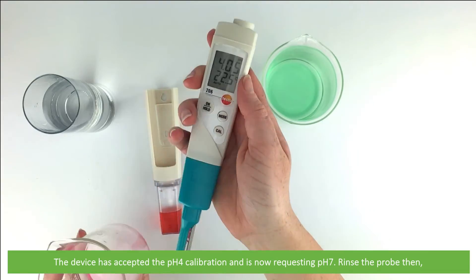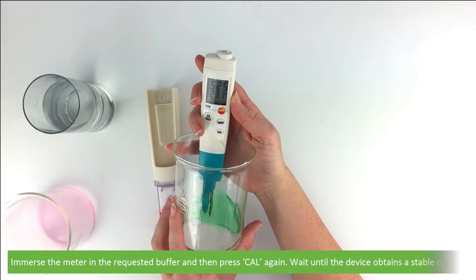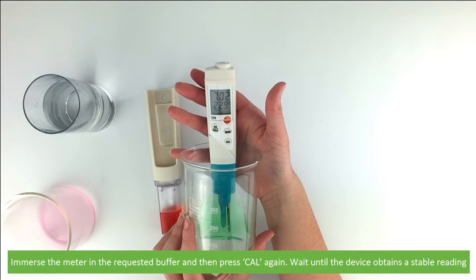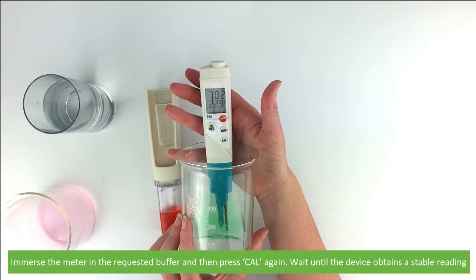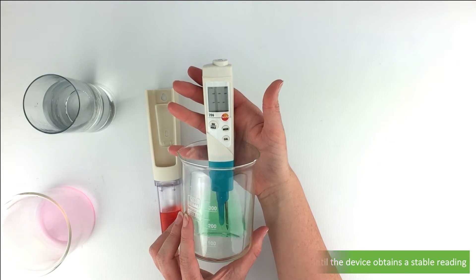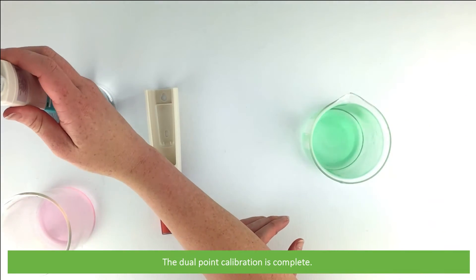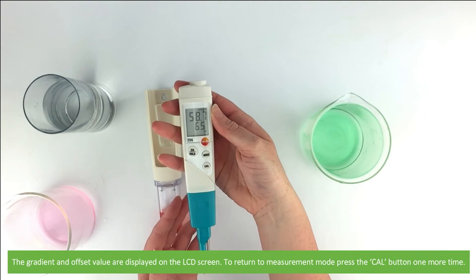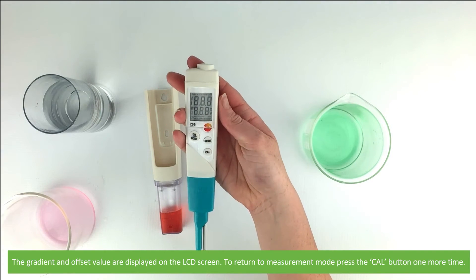Rinse the probe in the deionized water, then immerse the meter in the requested buffer and press cal again. Wait until the device obtains a stable reading. The dual point calibration is now complete. The gradient and offset values are displayed on the LCD screen. To return to measurement mode, press the cal button one more time.